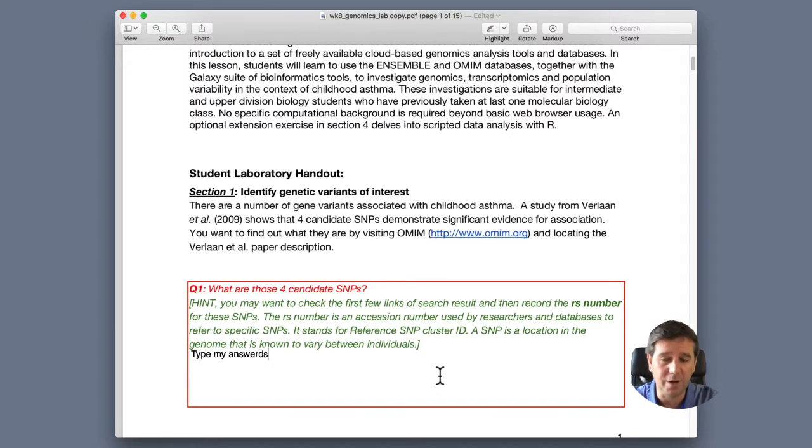And I can also spell correctly if I'm not looking in multiple places at the same time. Sometimes. Okay, so I can then save this document file, save, and then you can post that to wherever you want to go. So that's obviously not my answer to the first question. Let's go and find out the answer to this question.